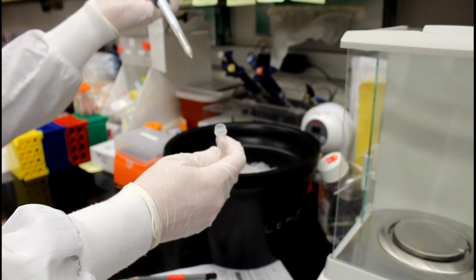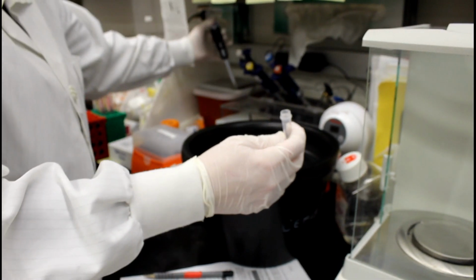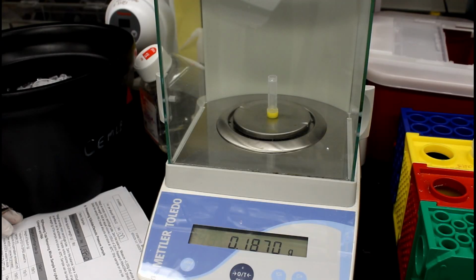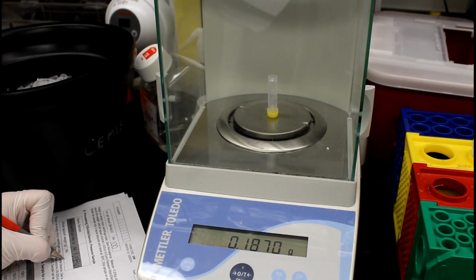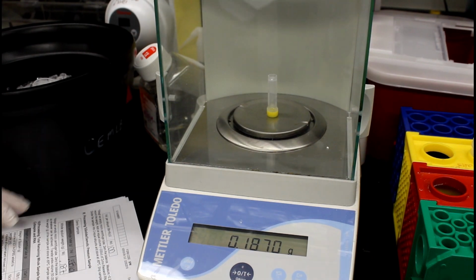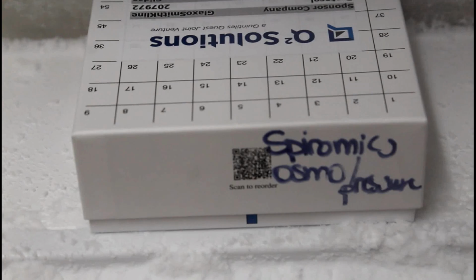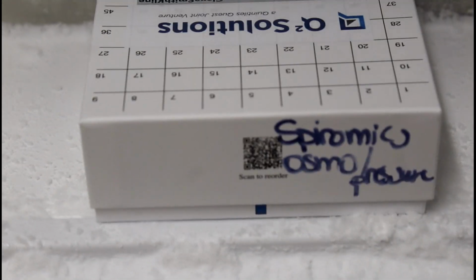Once you've done that, deliver the sample into an Eppendorf tube, which will be stored at -80 degrees Celsius. Record the weight of the sample on the worksheet. Store the sample for percent solids and osmotic pressure at -80 degrees Celsius.